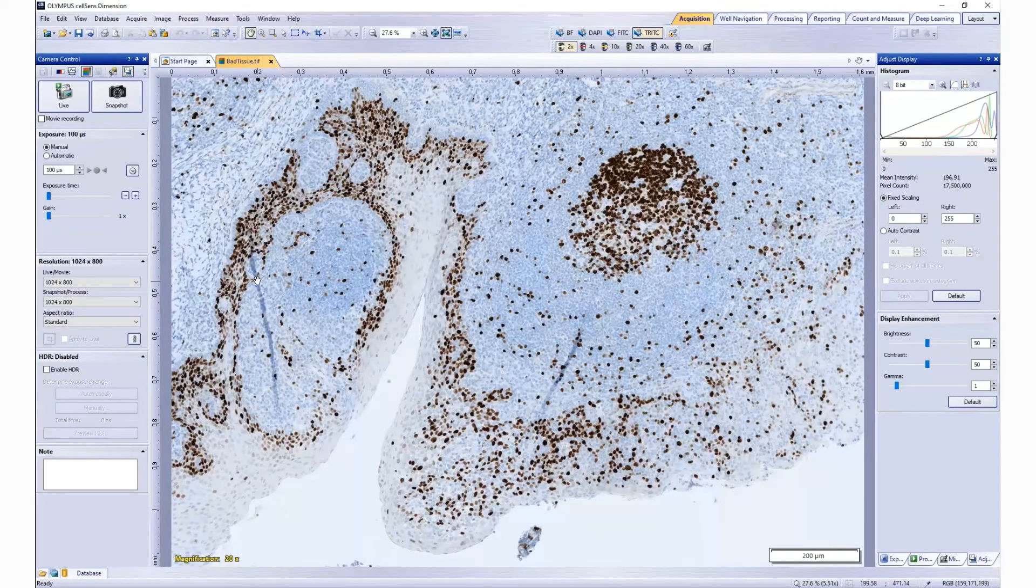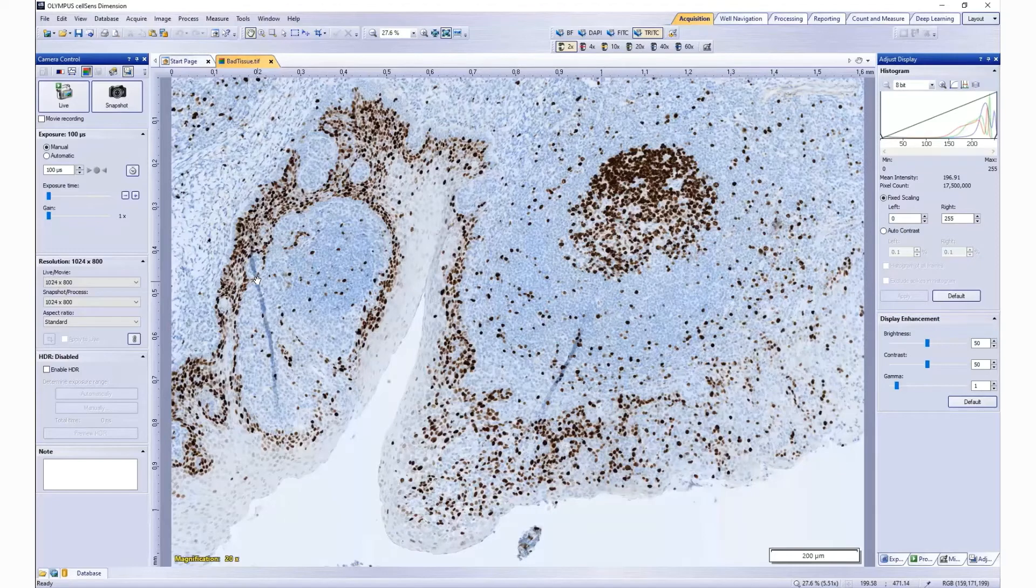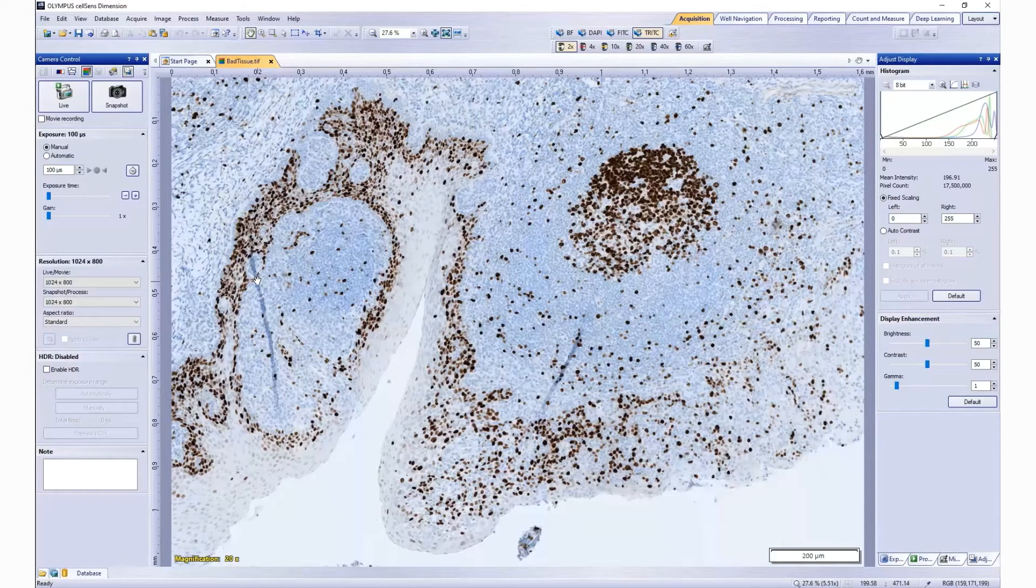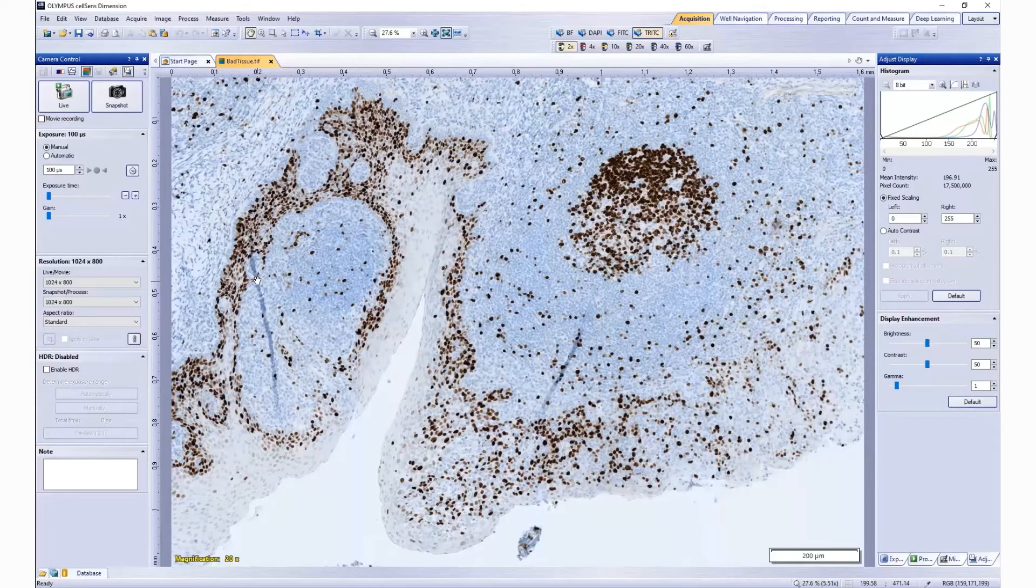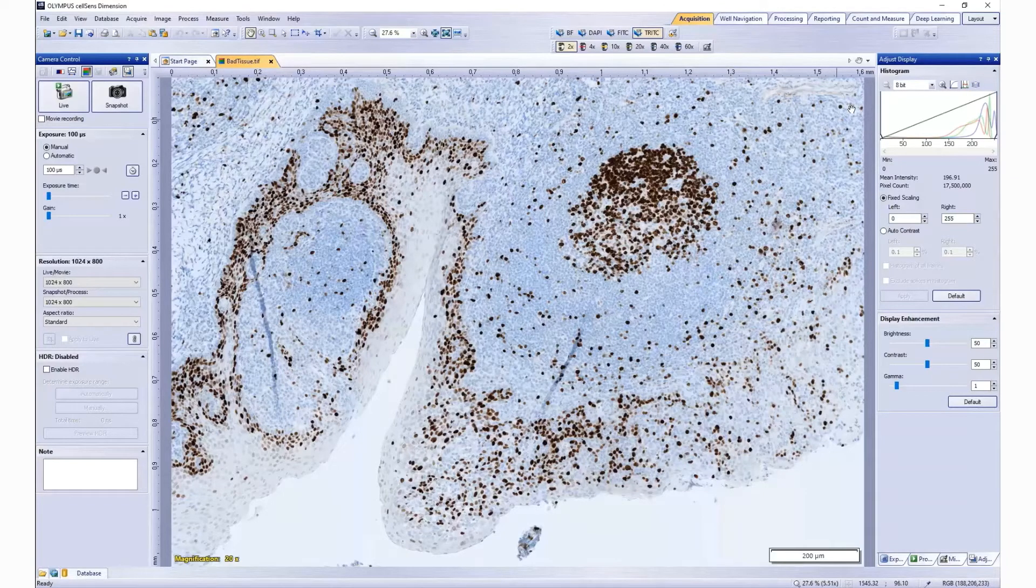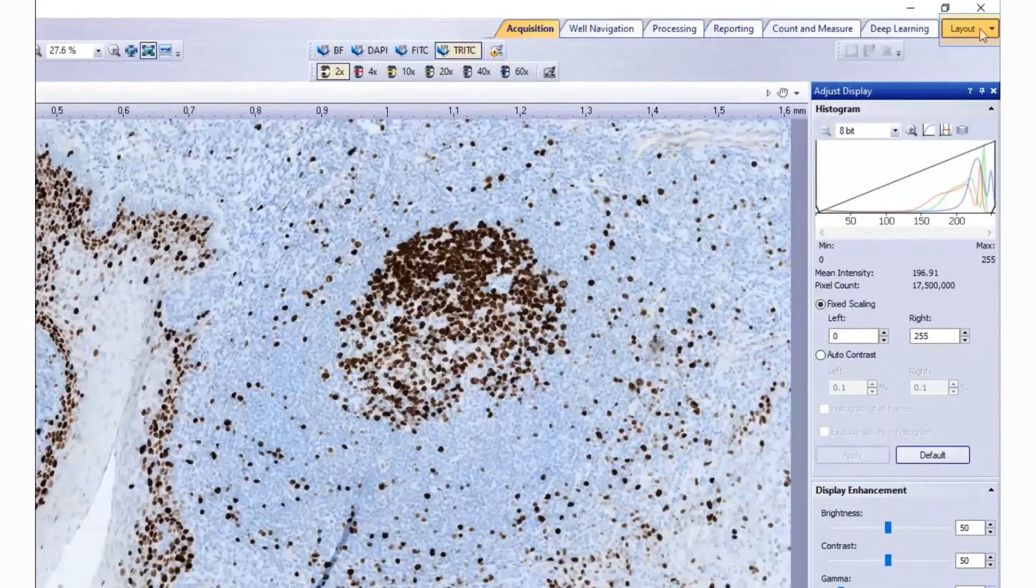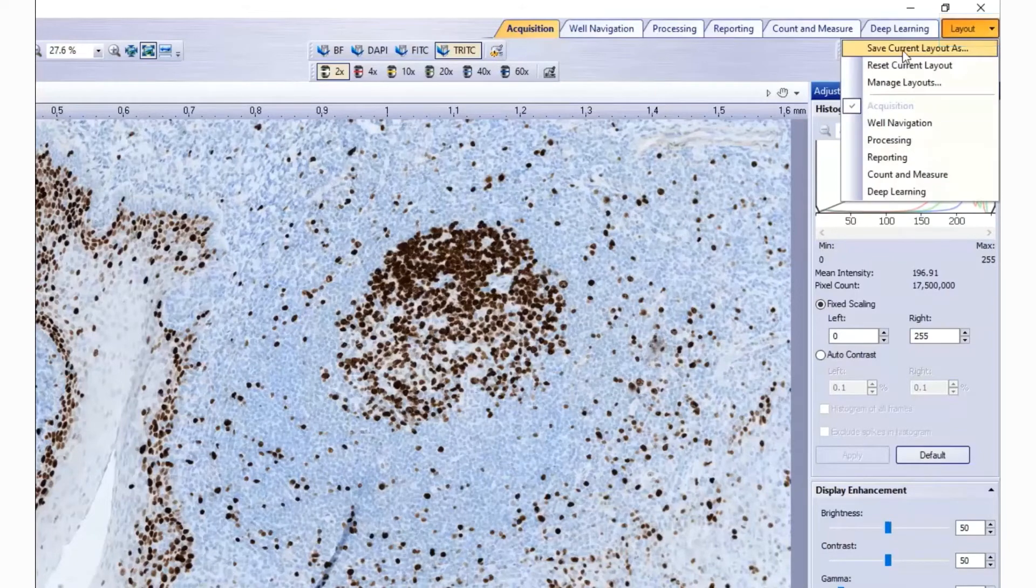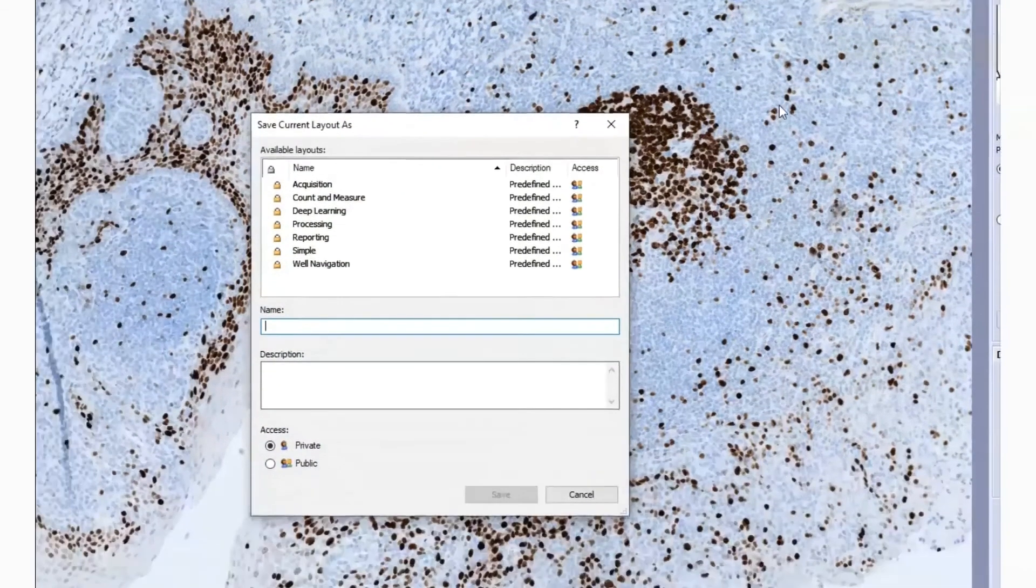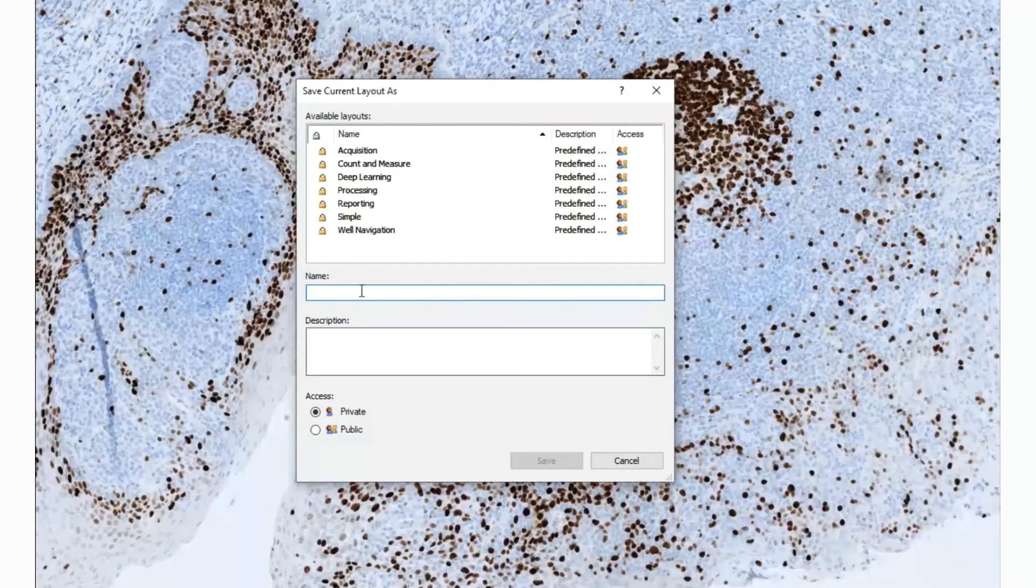Once you have set up all the toolbars and tool windows into a layout that you would like to easily access in the future, you should save it. To save the layout, click on Layout tab in the upper right hand corner and save current layout as. Give it a name.